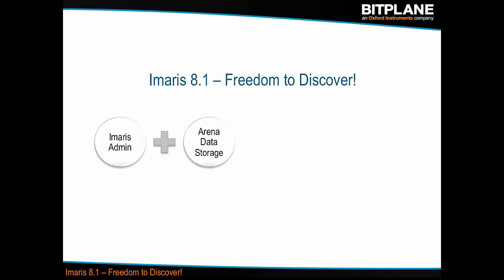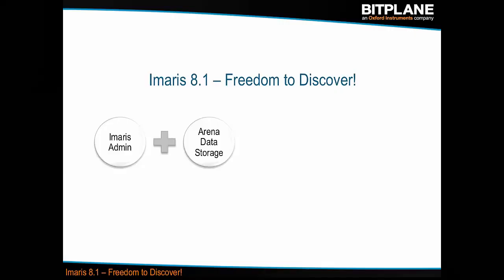We also have received a lot of great feedback from a lot of you about the way we store the data. When we introduced Imaris 8, the data became impossible to save with a simple file save as. It produced basically a database in the background, and it made it, for some people, difficult to utilize.